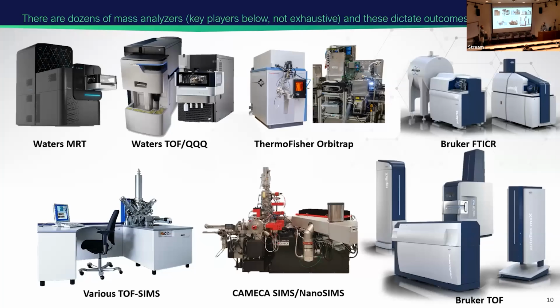There's been a lot of development, like Justin Chang from Thermo Fisher mentioned the other day, of actually bringing matrix-assisted laser desorption ionization to the Orbitraps to make these more accessible. You can actually purchase these and put them on. But all of these different instruments, whether they're the Bruker TOFs or anything in between, are quite expensive and require a fairly large knowledge base in order to actually use.